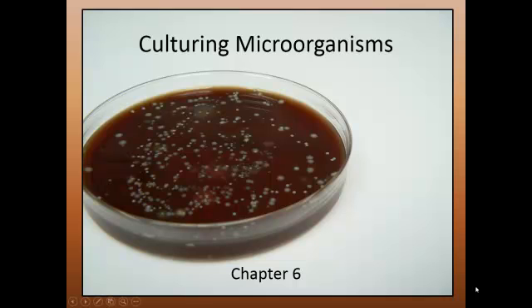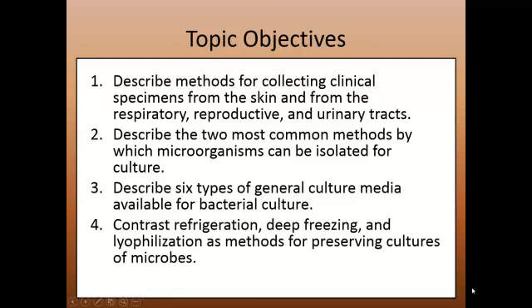Chapter 6, Culturing Microorganisms. The learning objectives for this topic are: describe methods of collecting clinical specimens from the skin and from the respiratory, reproductive, and urinary tracts. Describe the two most common methods by which microorganisms can be isolated for culture.